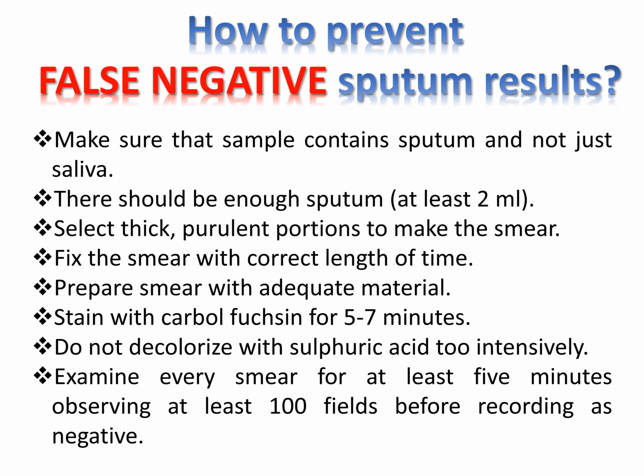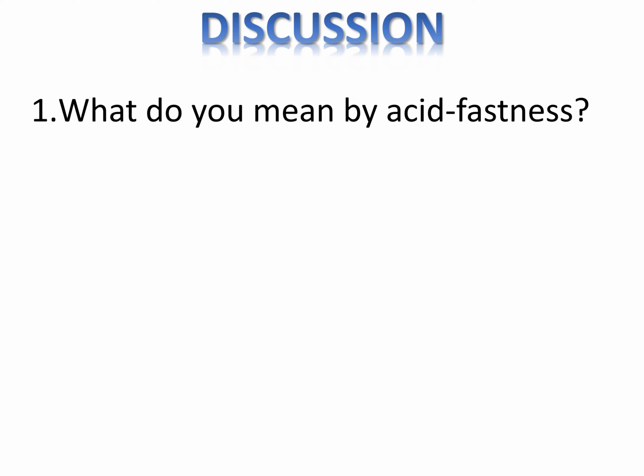Examine every smear for at least 5 minutes, observing at least 100 fields before recording as negative. The discussion part. This is the main goal of this video. What are the questions the examiners can ask you? What do you mean by acid fastness?